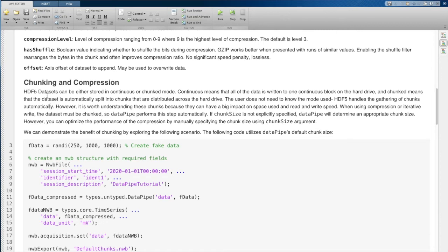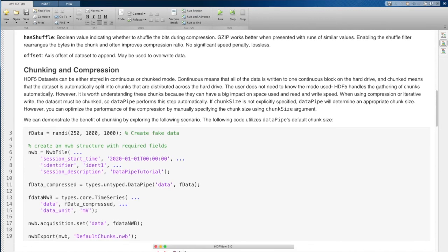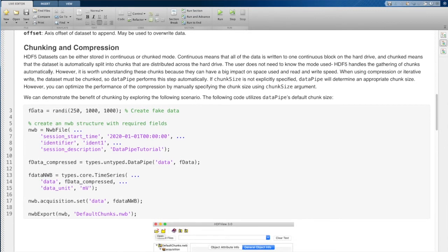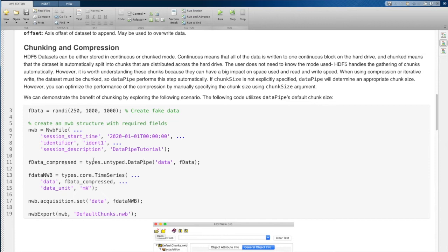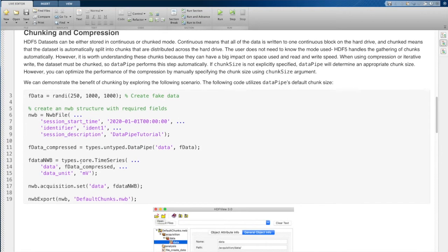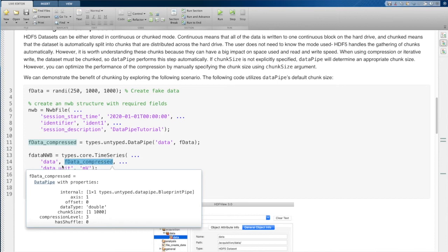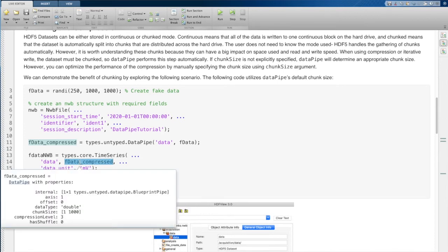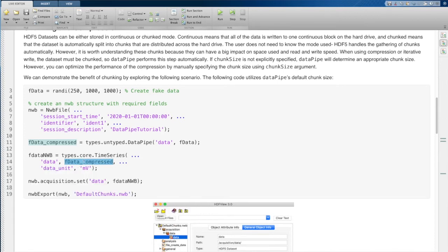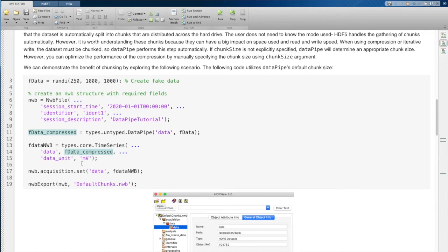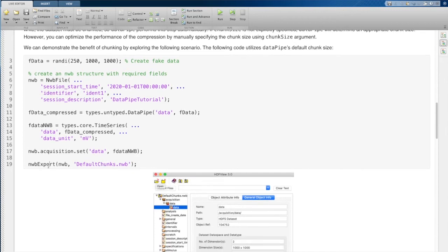So this is how you would do chunking and compression. I'm just going to make this random data set and create an NWB file. And then I'm just going to do the simple thing here, which is just to take my data and wrap it in a Datapipe object without any additional parameters. And then I'm going to take this and put it inside a time series right where I would have normally put data. I'm putting it right in that same spot. And then I'm just going to put that time series in acquisition because that's just the simplest place to put it.